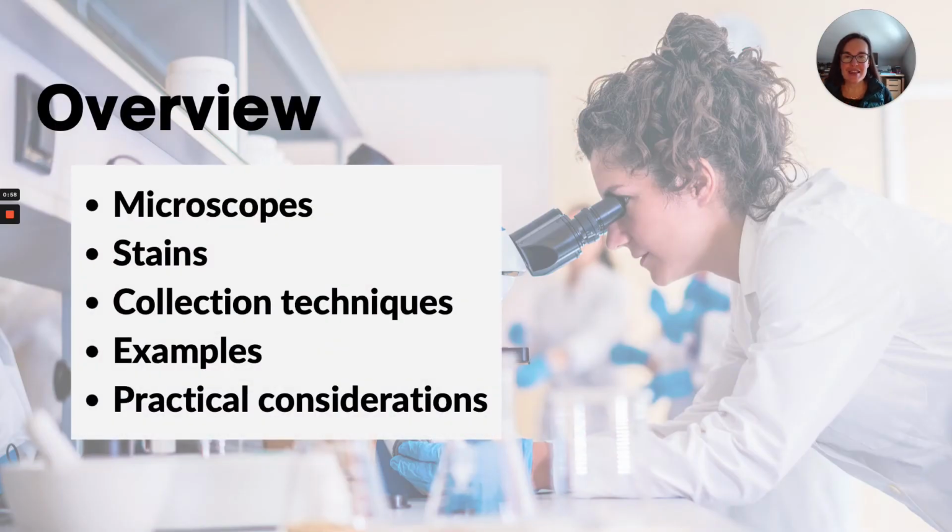In this lesson, I'm going to give you a little bit of an understanding of microscopes, stain collection techniques, some examples and practical considerations. Basically, I just want to review how I do cytology. In a future lesson, we'll actually look at cytology, and I'm going to try and bring in Kate Baker, my friend who has the Cytology Schoolhouse. We'll do some real-time looking at tape preps and how to interpret them.